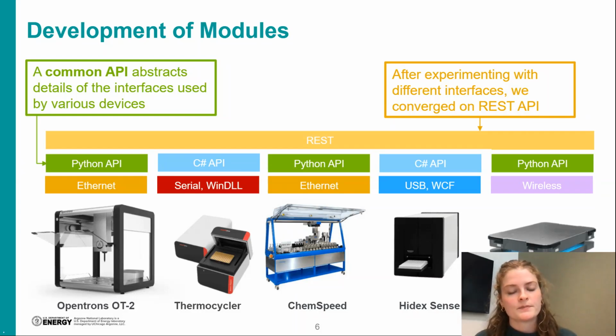The problem with integrating these kinds of instruments together is that oftentimes they come from different companies, and there's no standard amongst these companies about how they communicate with the instruments or how the instruments are meant to be used by the user, right?